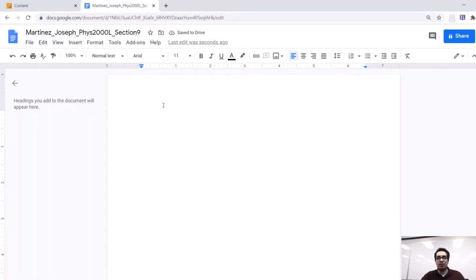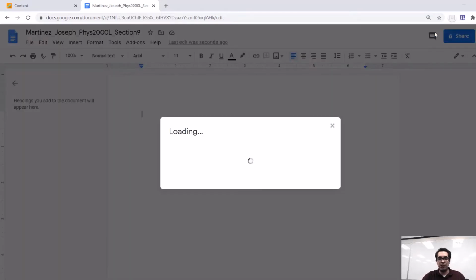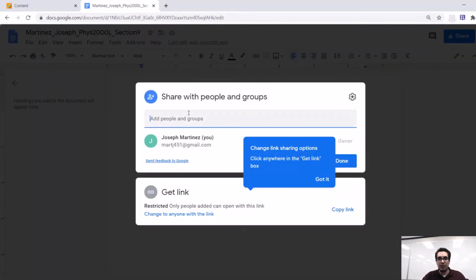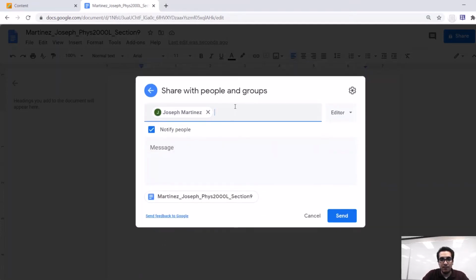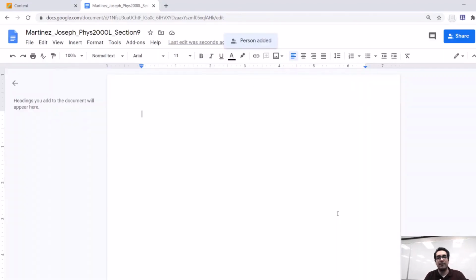Now we're going to share it with everyone in our group. We're going to go over here to the share button, share with people, and add names to this group so that everyone has access to this and can edit it. One person that needs to be on this is myself. Everyone's going to put my email on this, Joseph Martinez at CSUSB, and send that off and make sure that I have access to it. You can do the same thing for everyone else in your group, so everyone has access to the same notebook and the same file.